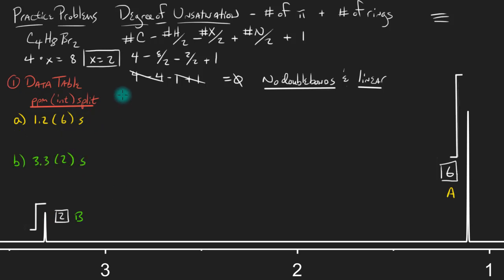Okay, so this brings us to the second part of the 4 to 5 part method, and we're going to have to do some work trying to figure out what kind of hydrogen sets we might have. It's going to be really useful at this point to start thinking about these hydrogen sets as puzzle pieces. Just like you get a 1,000-piece puzzle, you have all these puzzle pieces that you have to try to fit together. This is the exact same thing that we're going to have to do here. We're going to have to take puzzle pieces of CH, CH2, CH3 groups, and whatever other oxygen, nitrogen, carbon, and put them together.